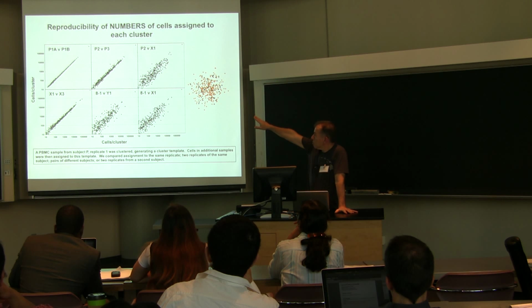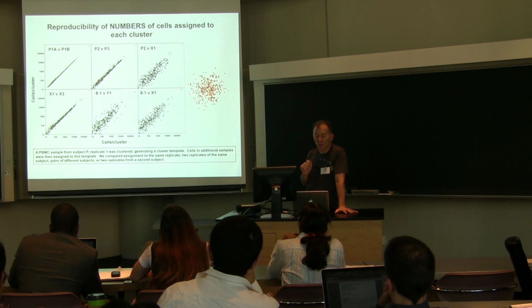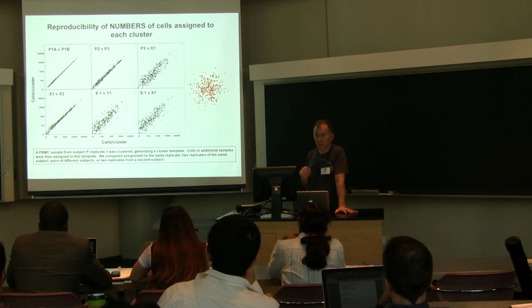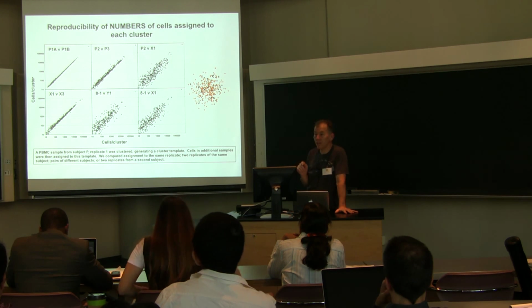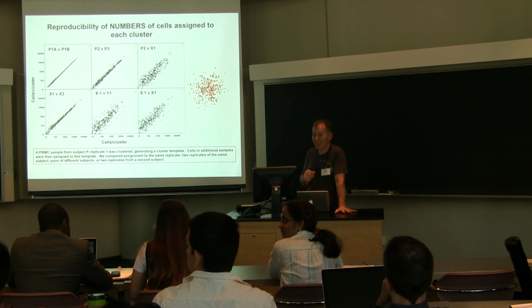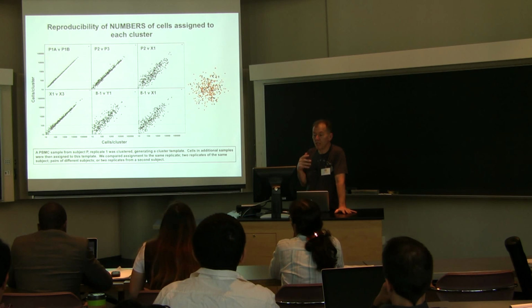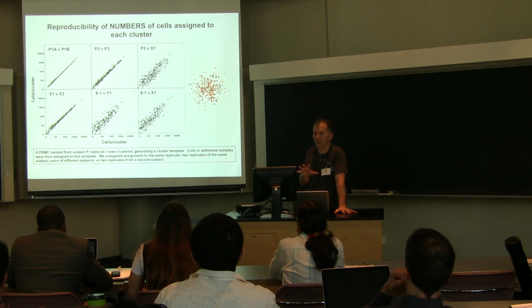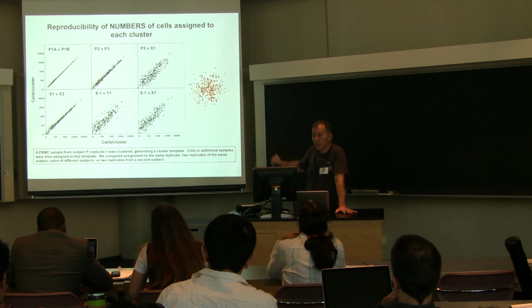The next one, P2 versus P3. P1, P2, and P3 are replicates of the same sample. So they're biological replicas, 3 wells in a staining tray. I should point out that these are very nice replicates, and for that we have to thank Jason Weaver, who's sitting there in green and white, because these are his samples, and we like these samples because they are a very reproducible set. They're very well-controlled, high-quality data. So the middle panel, it's not perfect, but it's still a pretty good correlation.